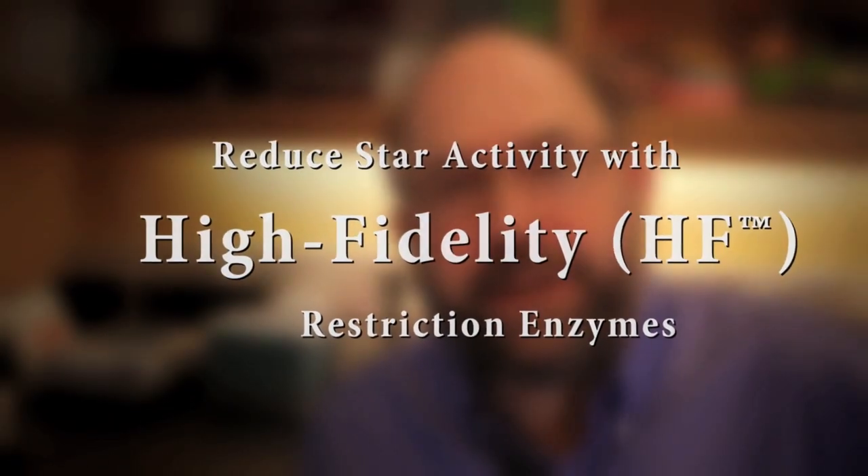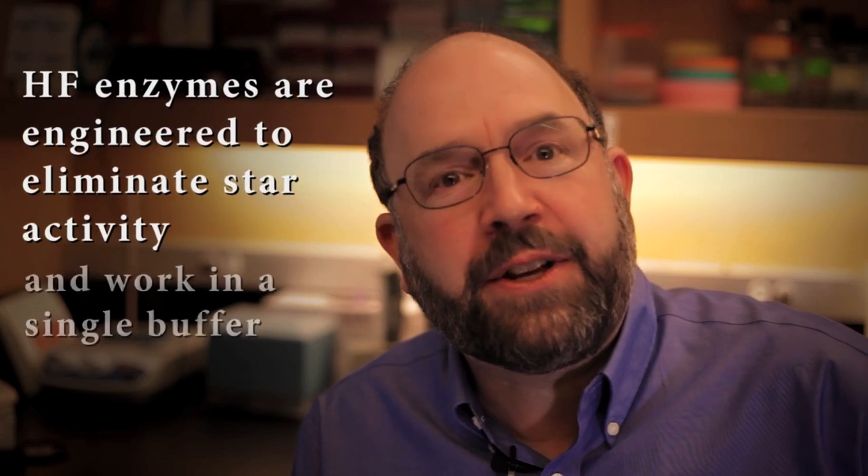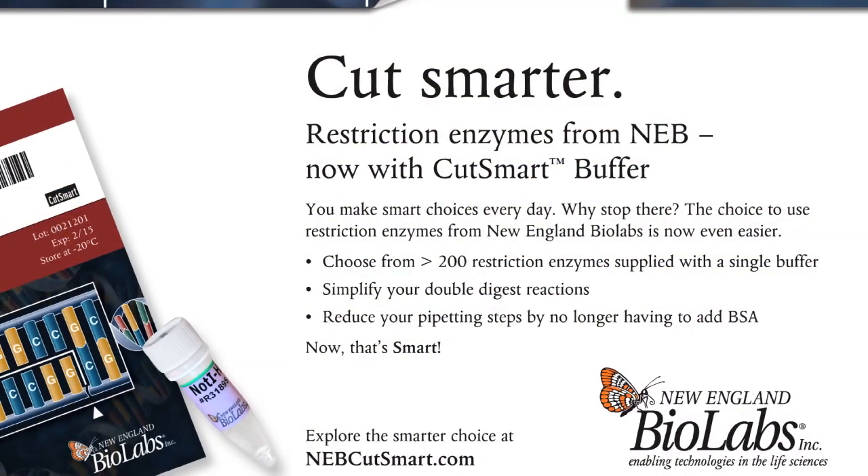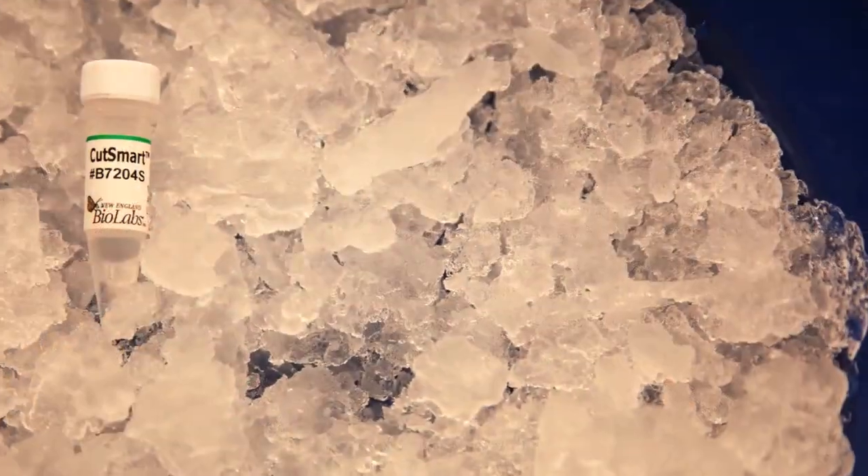The NEB High Fidelity, or HF enzymes, have been engineered to eliminate star activity and also to function in a single common buffer, the CutSmart buffer, which is especially helpful when doing double digests.